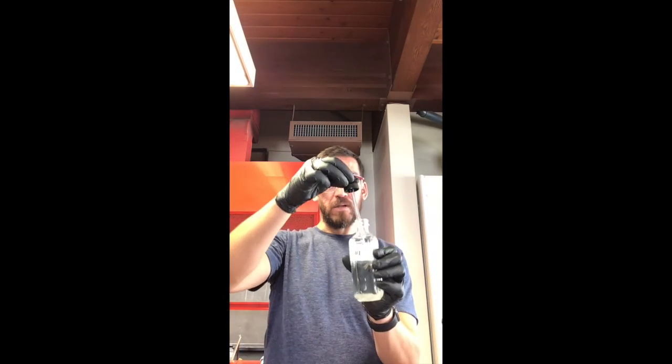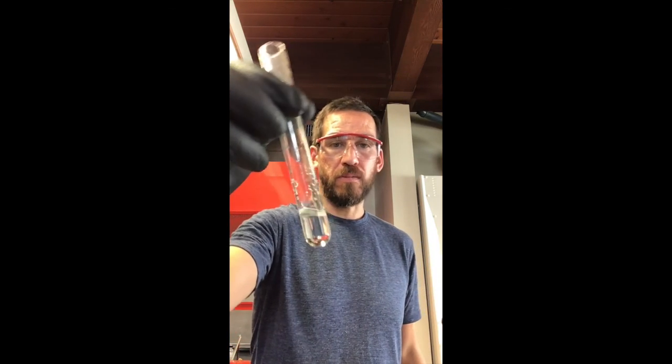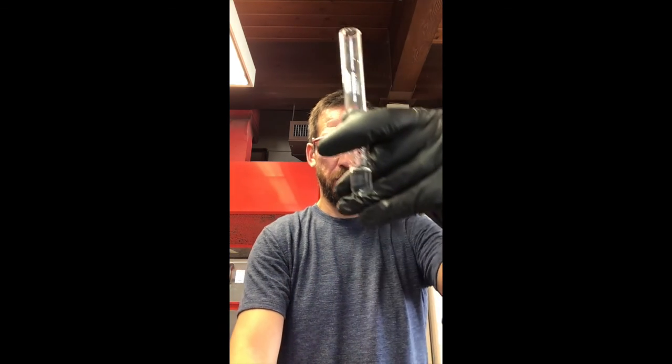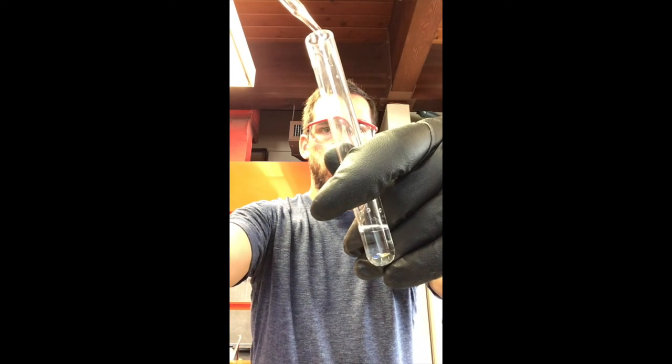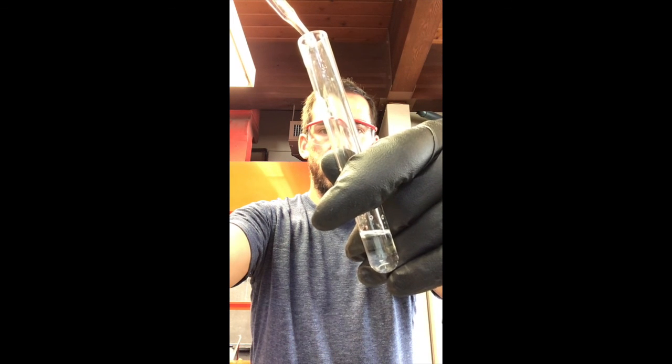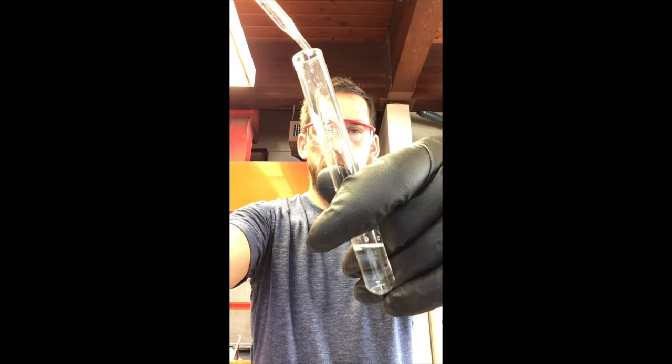That doesn't mean that we're done, right? We still need to check out unknown number 1 with number 2 and see what happens. So, unknown number 1. Okay, so we've got unknown number 1 here. Now, unknown number 2. Let's try it again. You can see the volume going up.